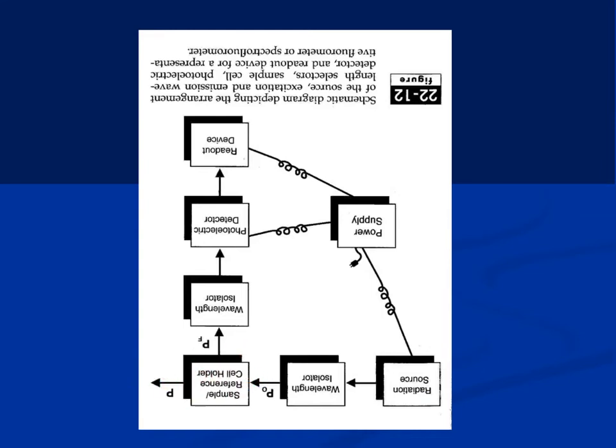This side was your UV visible spectroscopy, because that is absorption, how much light is absorbed, whereas the emission will happen in all directions. When the molecule is emitting light, it doesn't distinguish between this direction or that direction, it just emits light in all directions. So mostly the observation is done at a right angle to the incident light. That's where the detectors are.